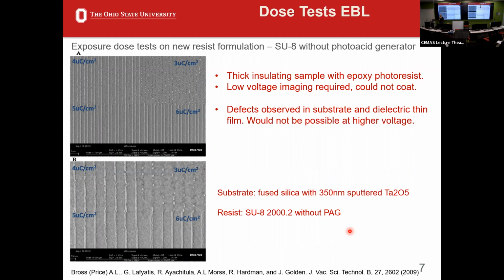It's a cool thing to show students, but it requires a lot of patience, right? Depends on how you've mounted the sample itself, if you put a ground on it, that kind of thing. So Hank's nodding, so I feel better about my explanation. Do you have good samples for that? Yeah, that's very in my interest. I can generate them.